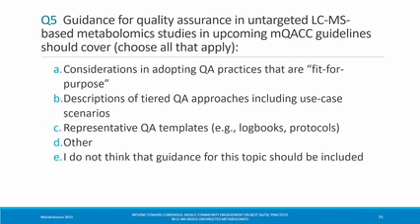I'm an audit expert in ISO 9000. And of course, for quality assurance, the first is the internal assurance. Then, how can we prove, how can we have evidence of the assurance in your lab? And then we can think about the second stage, that is external assurance.